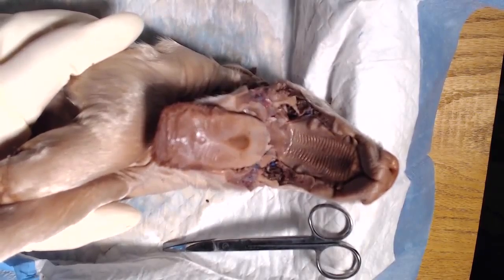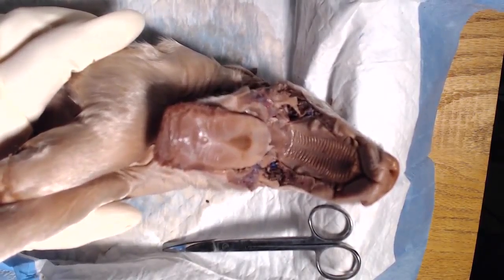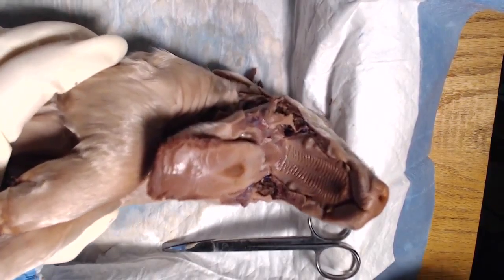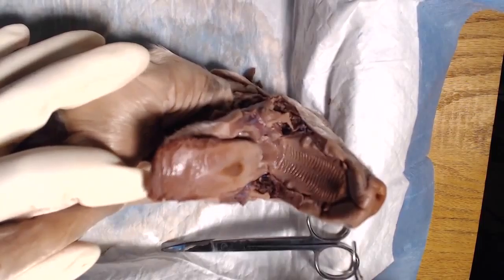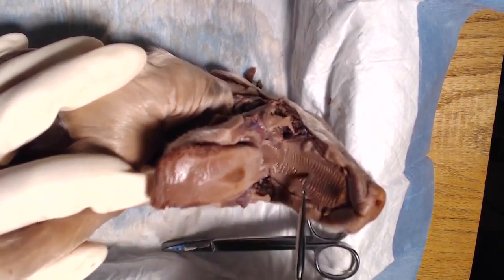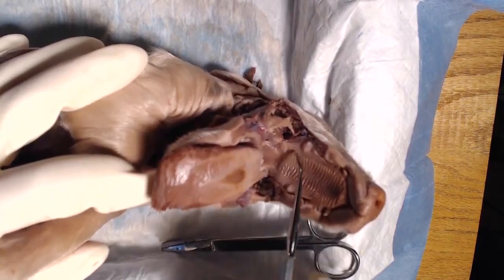All right, so hopefully everyone's gotten to this point. If not, just send us a message and we'll slow down. But right away, looking here, we can already see a lot of structures that Dalton talked about in his presentation. So let's look at the roof of the mouth first. You can see all these little ridges right on the roof of the mouth up here. This is what makes up the hard palate. This whole section with the ridges is the hard palate.